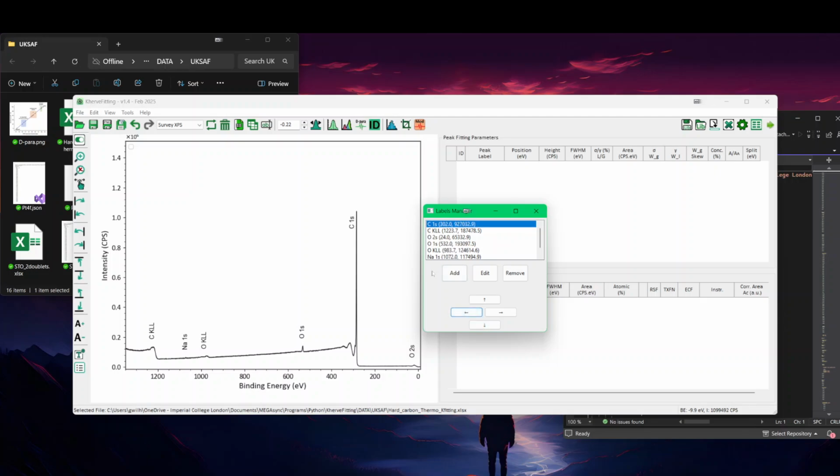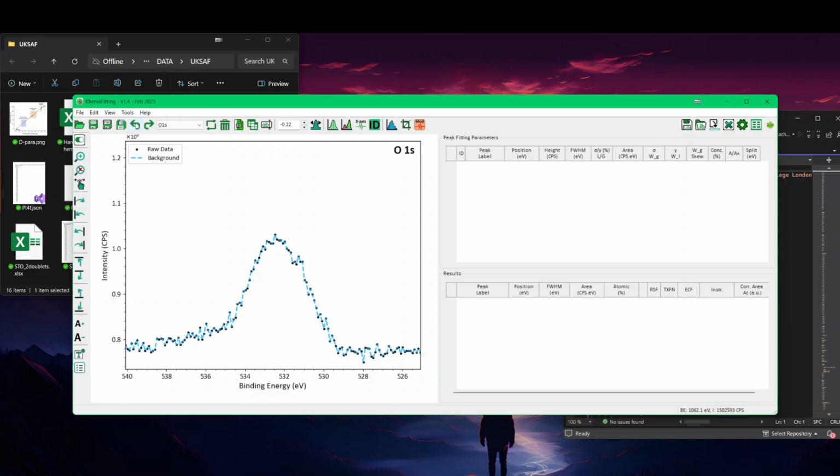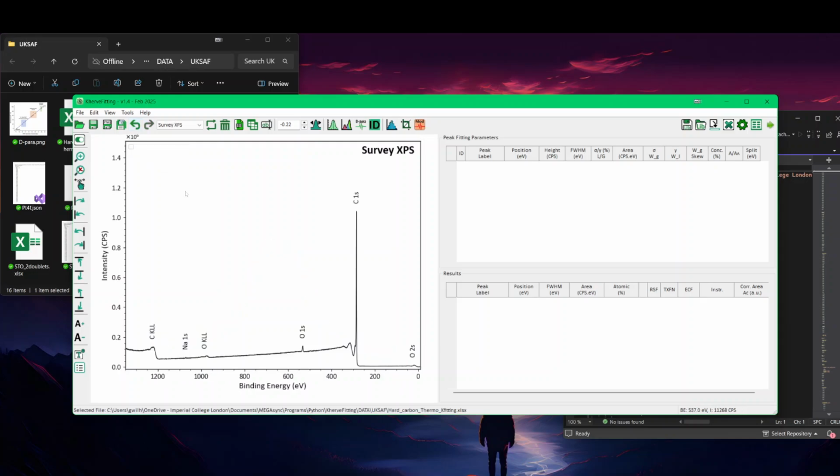Maybe that's where you prefer it, and you may want to edit it, change the label as you like, or even add some more. Let me see if this works, yep. So that has been changed, now put back using the undo.